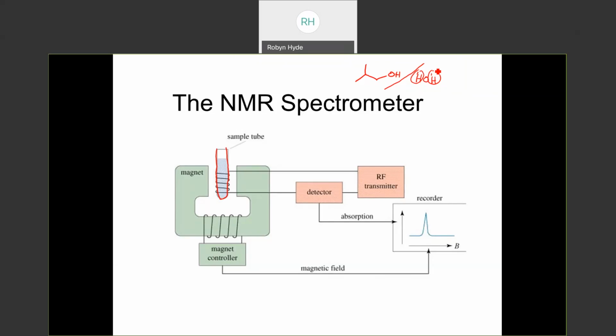Instead of using normal solvents in the lab, we use deuterated solvents. Deuterium is heavy hydrogen, and so it does not have the property of spin. Instead of dissolving in water, we will dissolve in D2O. So then our solvent is not NMR active.